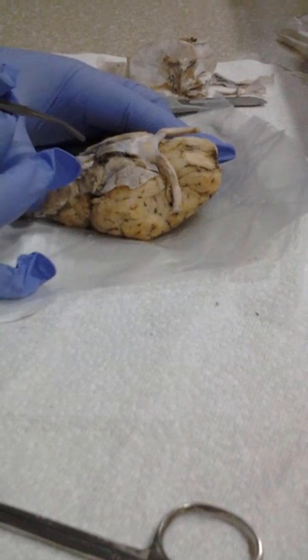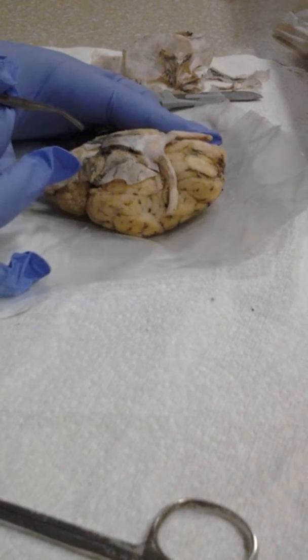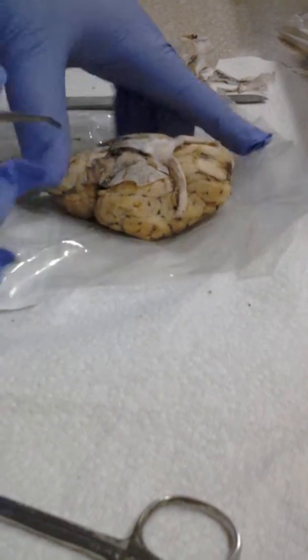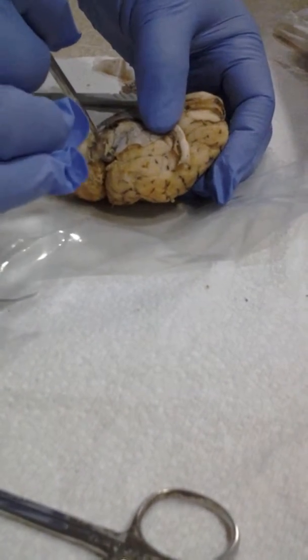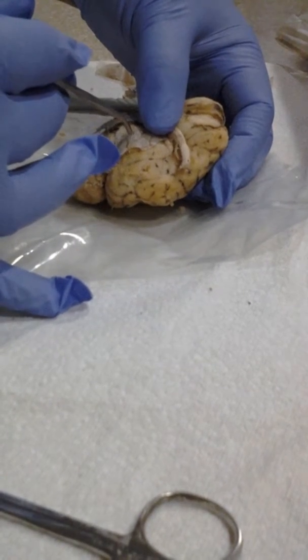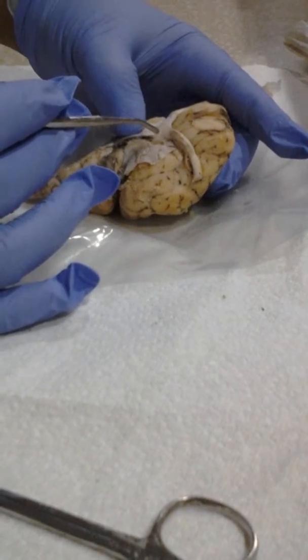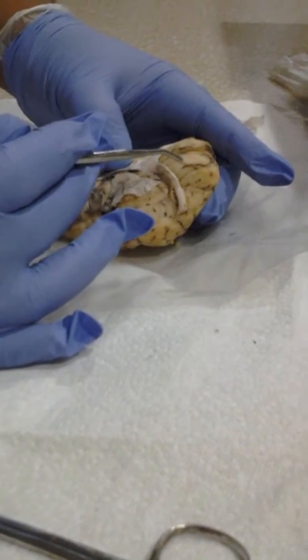Below it, you have the hypoglossal nerve. And then below that is the accessory nerve. On this side would be the vagus nerve. A little bit above that, you would have the facial nerve. And then a little bit to the top, more would be the trigeminal. And last, over here in this area is the optic nerve.